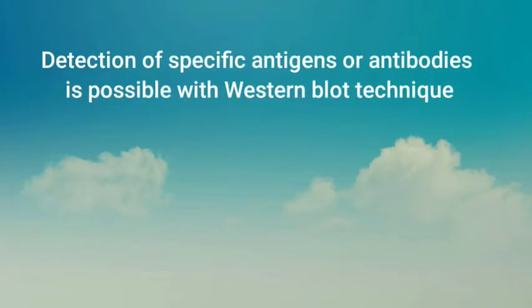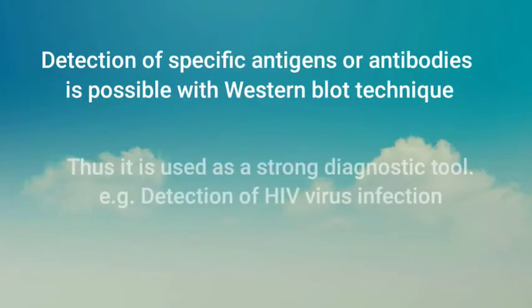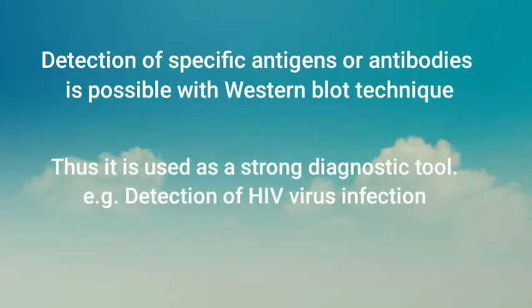Detection of specific antigens or antibodies is possible with the Western blot technique. Thus, it is used as a strong diagnostic tool in clinical medicine. It is used for detection of HIV infection.